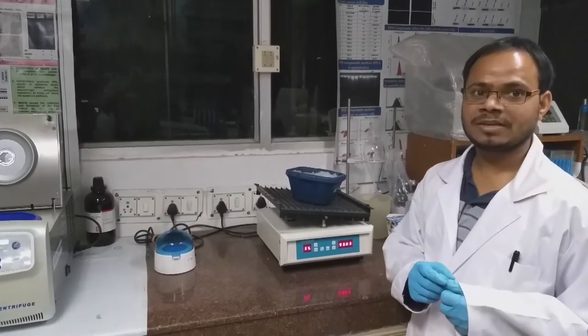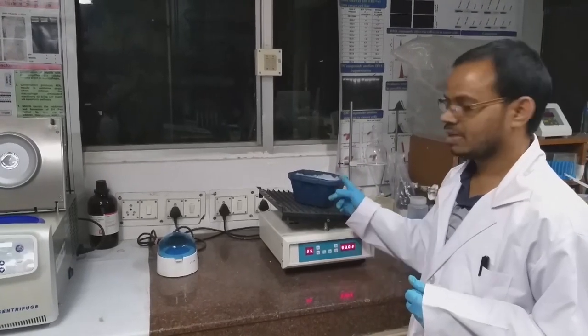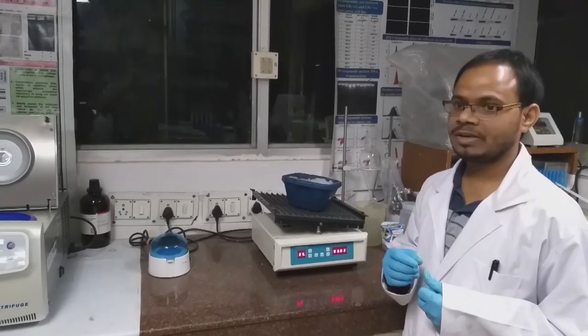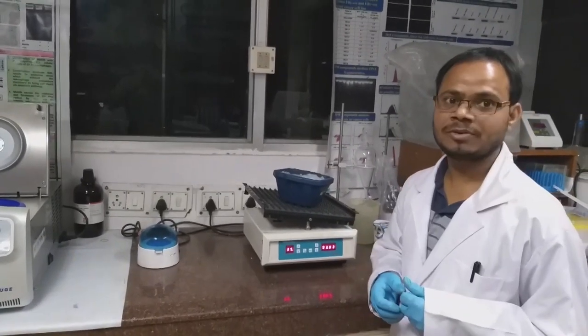Once column packing is over, we keep it on ice, and we keep it in this condition for at least 2 hours for binding, so that the histagged protein will bind to the nickel NTA, and in further steps we will elute the protein.